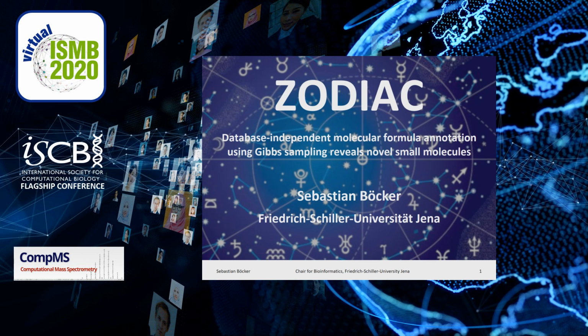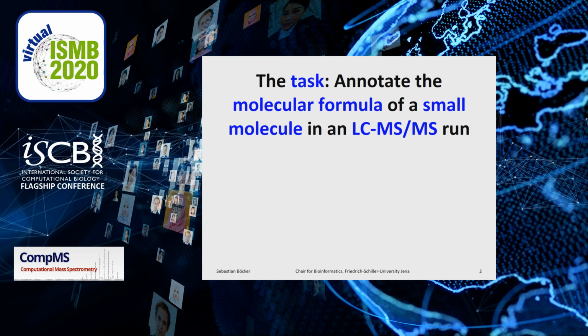I'm from the Friedrich Schiller University in Jena, and I'm going to talk about ZODIAC, and we don't have much time, so let's jump right into the topic. Our task is the annotation of molecular formulas of small molecules from MS data. We assume that we have complete LC-MS runs, and we want to do that de novo.